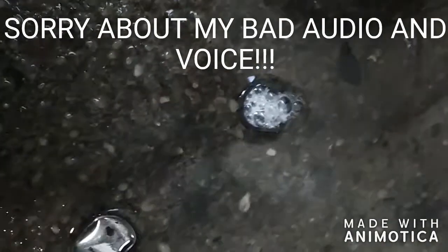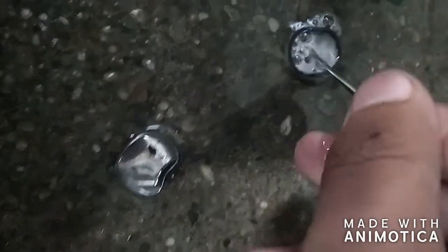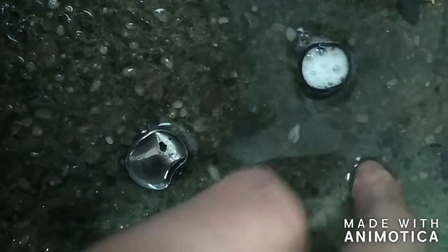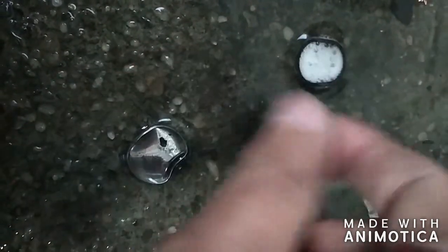Hello ladies and gentlemen. Today I will be extracting lithium from this lithium coin cell battery. We can see it is lithium because it fizzes when I add water to it, and the residue on my fingers feels very slippery, indicating that a base like hydroxide has formed.